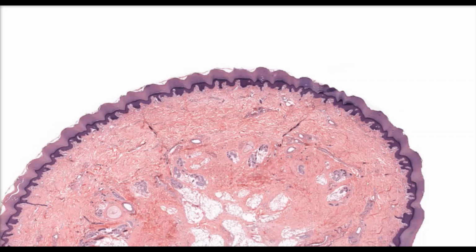The first type of stratified epithelium we'll be looking at is keratinized stratified squamous epithelium. That seems like a lot, so let's break the term apart. Stratified tells us that we have multiple cell layers. Squamous means that the cells in the uppermost layers are flat. Keratinized means that the cells in the upper layers of the epithelium are filled with a protein called keratin. Keratin makes the cells waterproof and also causes them to die.